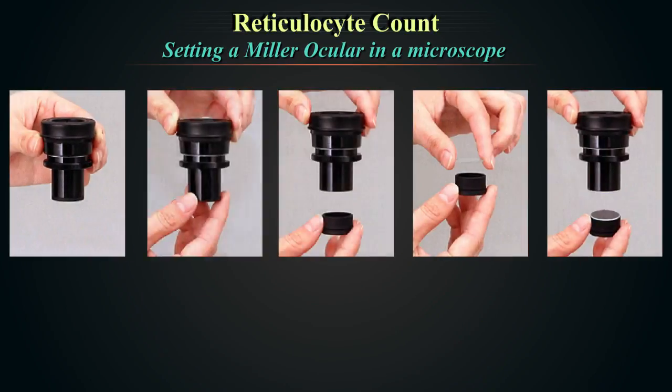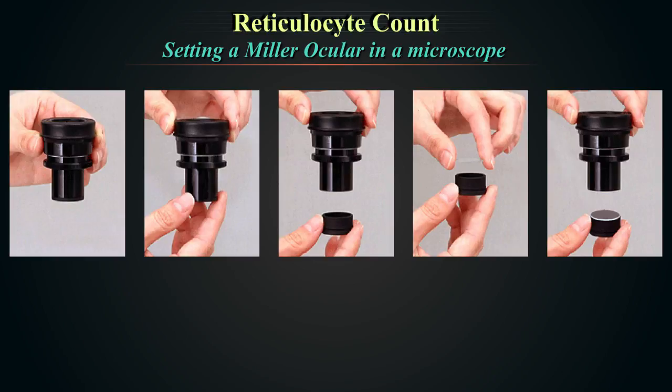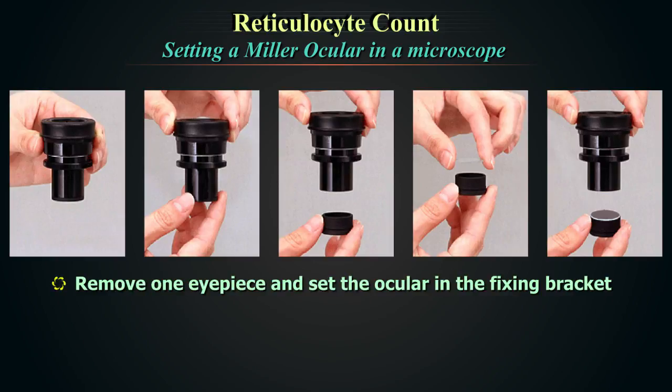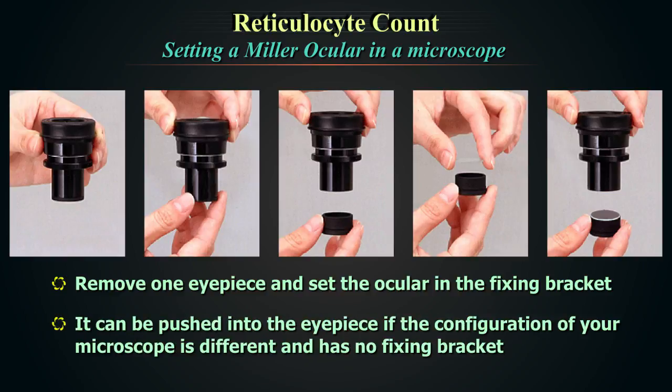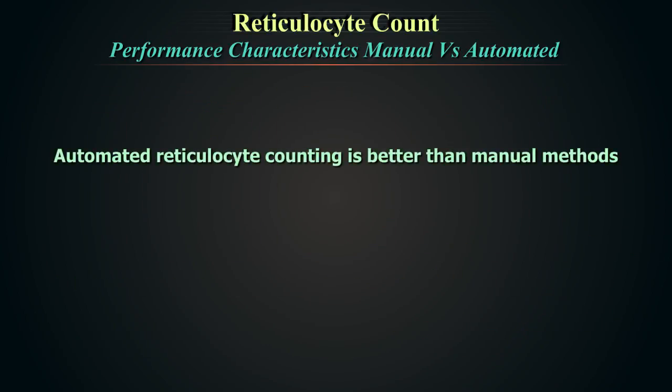To set up a Miller's ocular in a microscope: remove one eyepiece and set the ocular in the fixing bracket. Turn the end of the eyepiece counter-clockwise and remove the fixing bracket for the micrometer. Place the micrometer on the fixing bracket with the printed surface down, then place it into the eyepiece. The exact setup may differ between makers and models.